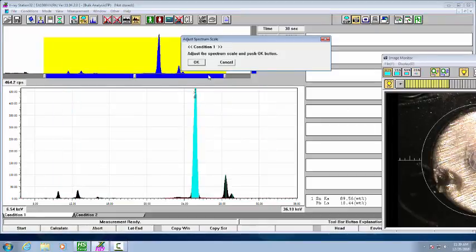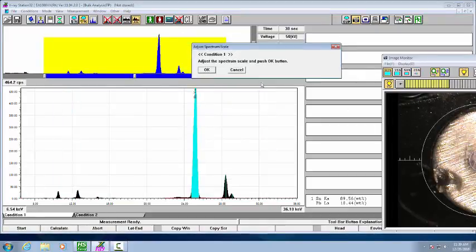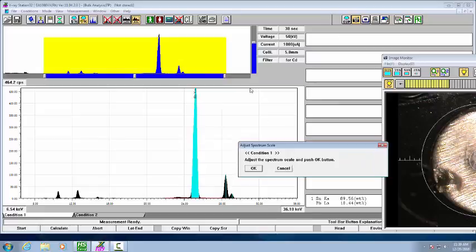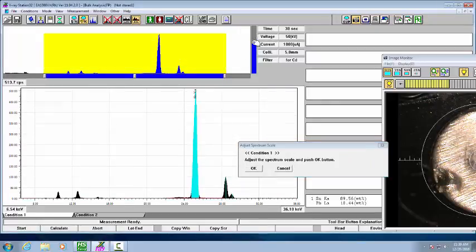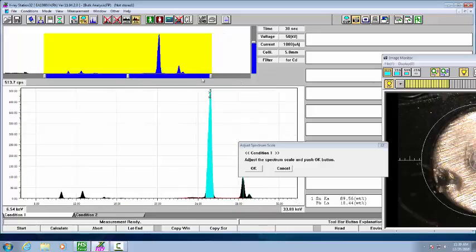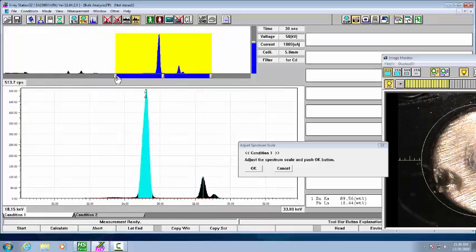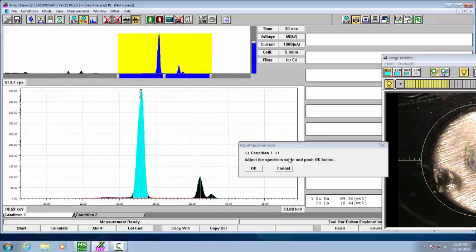And then adjust the scales for our condition number one, using this button to get this peak the way you want to see it. You can also limit it left and right so you see just the tin.